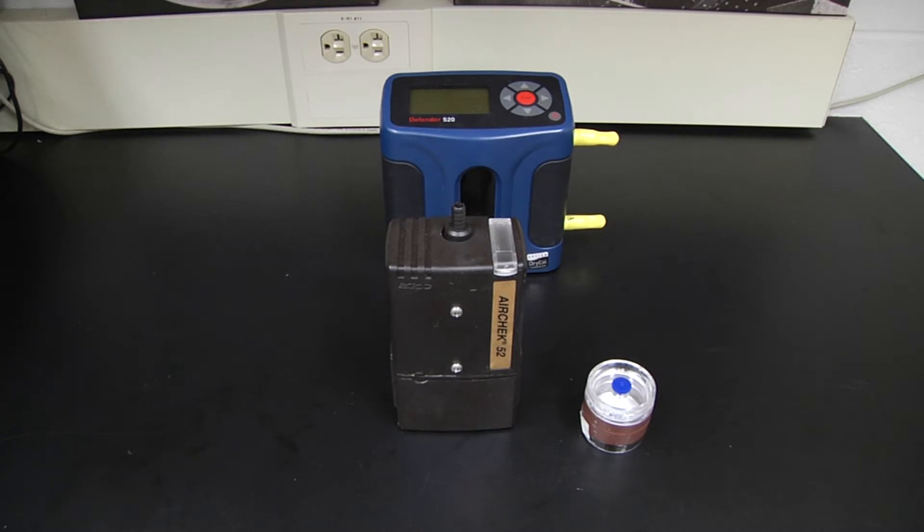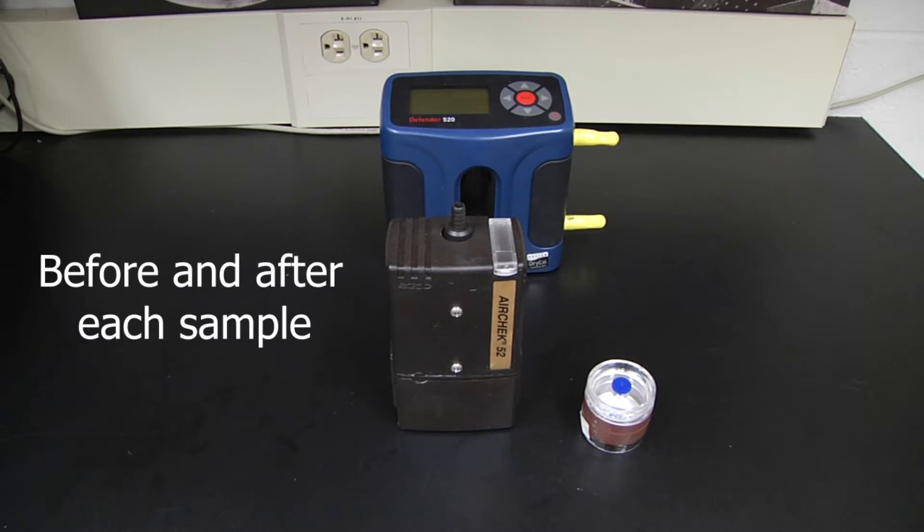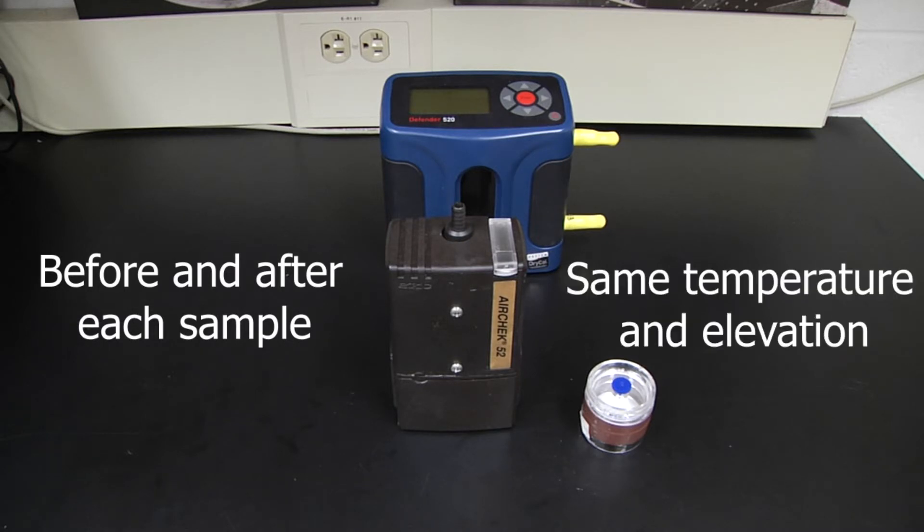Air sampling pumps need to be calibrated directly before and after each sample in order to accurately calculate the volume of air that's been sampled. You should also calibrate your pumps at a temperature and elevation or pressure that's as similar as possible to your sampling location.